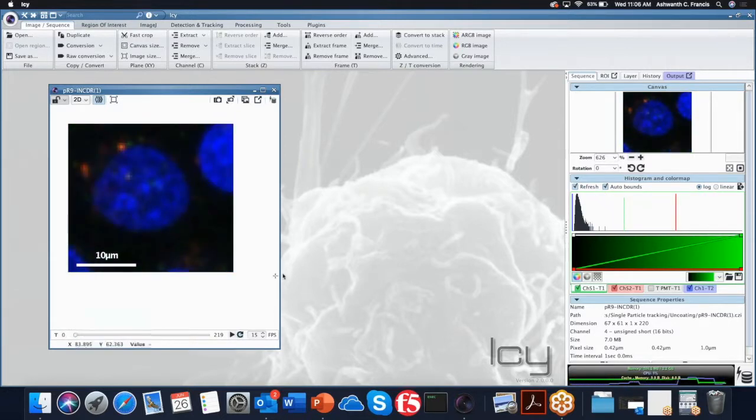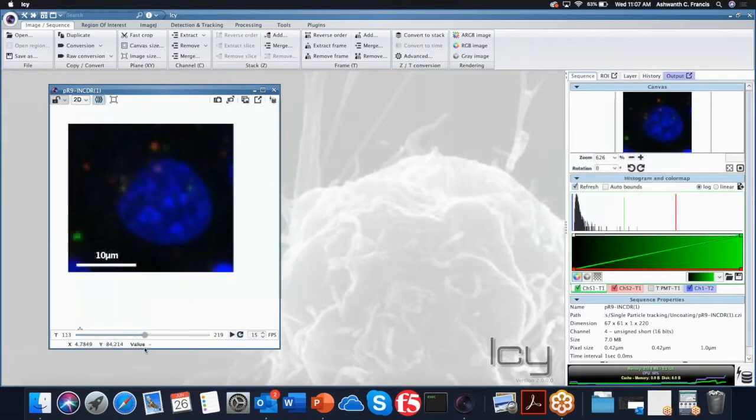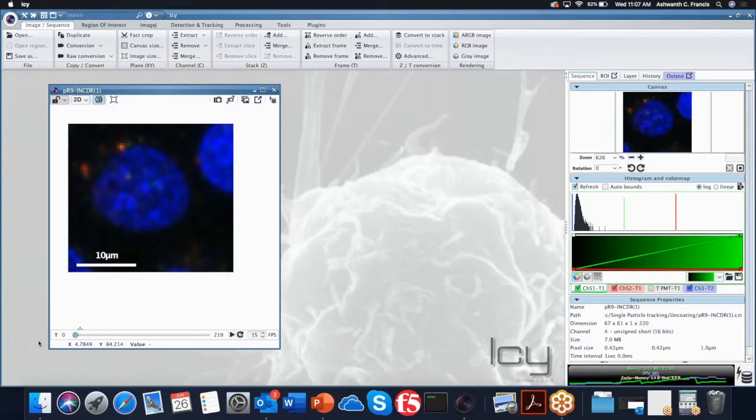Okay, so when you want to do that, you want to remove these auto bounds. Do you see this auto bound on top of the imaging threshold here? You want to uncheck that. Because when you uncheck that, it will not change the intensity of your image as you scroll down. Did you guys manage to uncheck that? Yeah. So you're seeing this now.